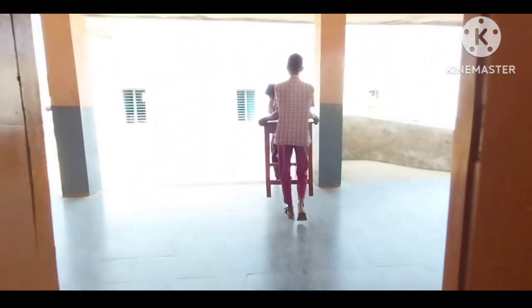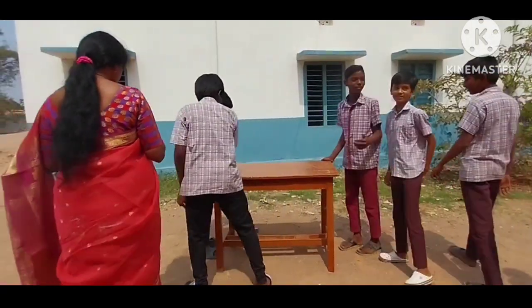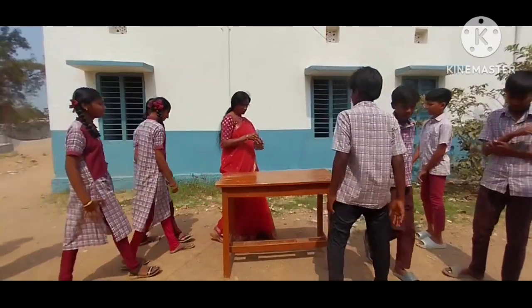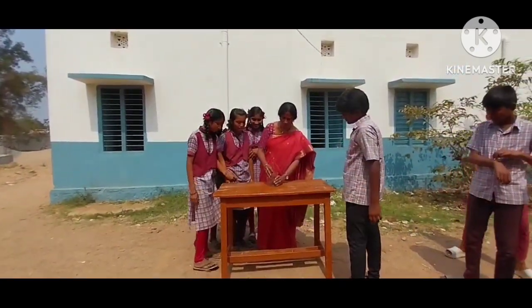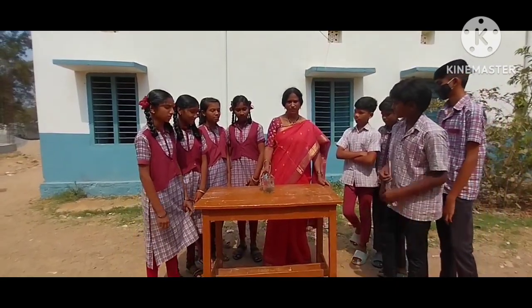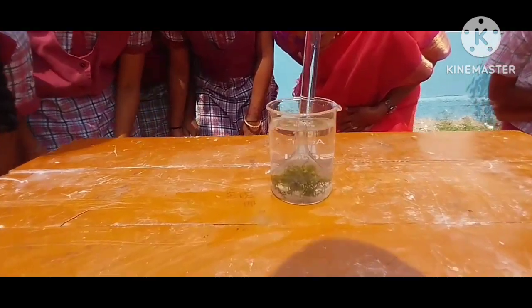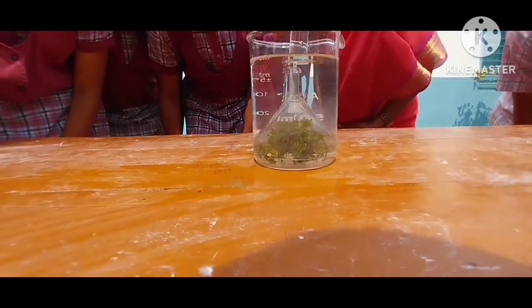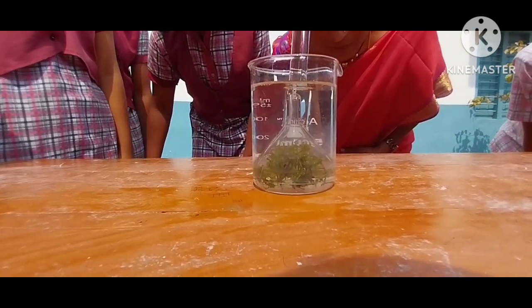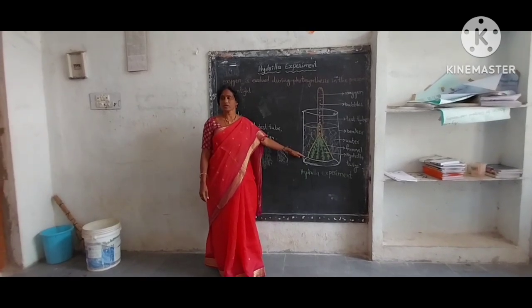I kept this setup in the sunlight. Observe, are there any air bubbles? No. Small air bubbles are coming. Okay, after 5 minutes we will observe. Okay, all of you draw this diagram in your notebook.